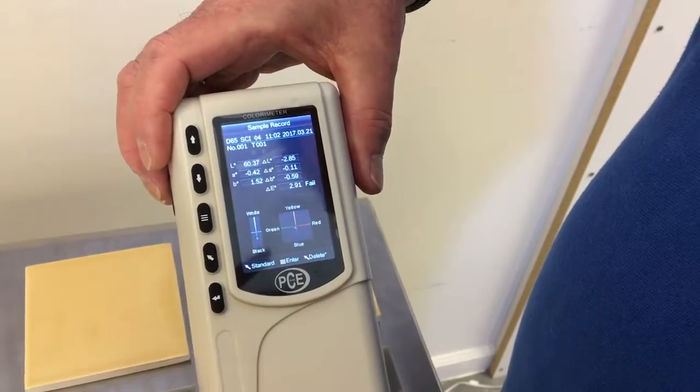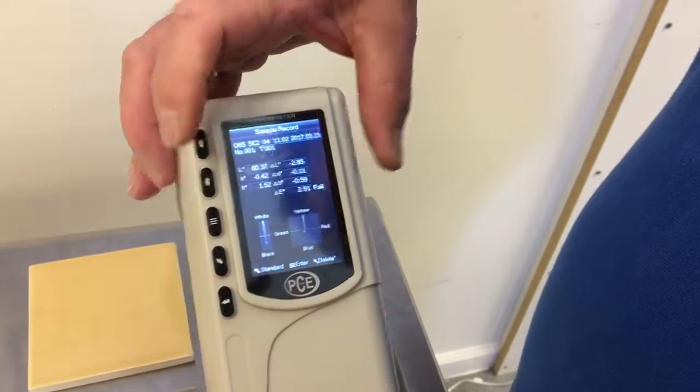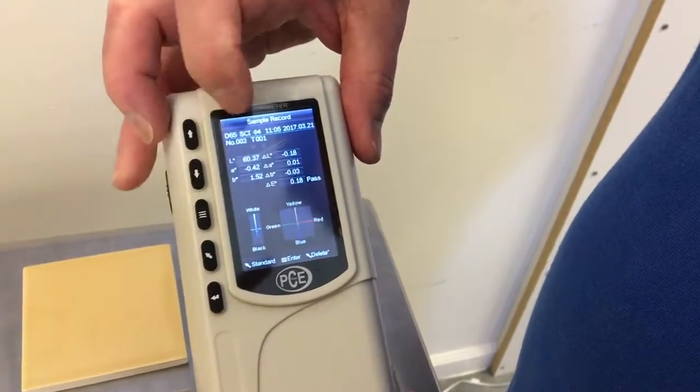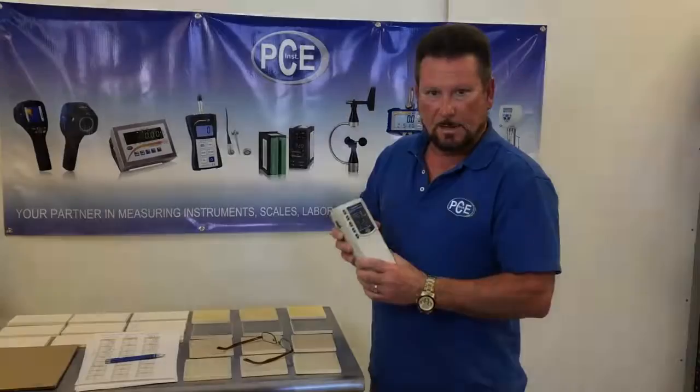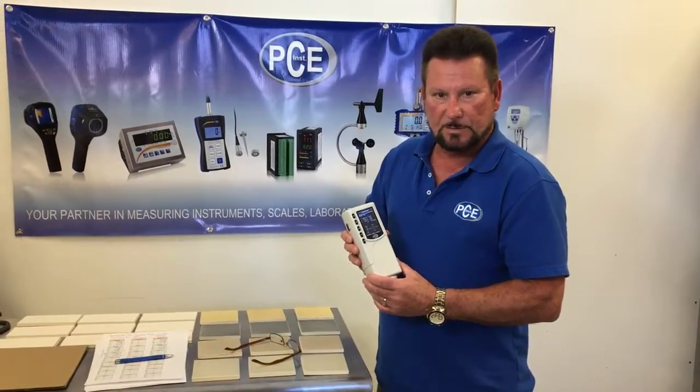If you want to look at your readings, you can go into the record menu and go one, two, three. As you can see, the PCE CSM1 color meter is easy to use. And if you have any questions, give us a call and we're here to help.